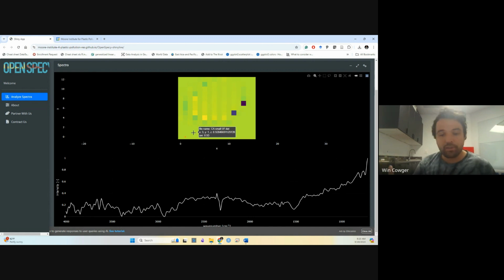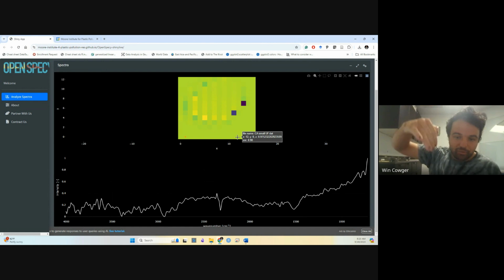There are different ways that you can present the particles to the hyperspectral imager. The way that we're doing it right now is we're trying to collect what's called a transreflectance spectrum. Basically, we focus on a stainless steel background when we're collecting our signal, and we want the light to pass through the particles, bounce off the stainless steel, and come back to the detector.